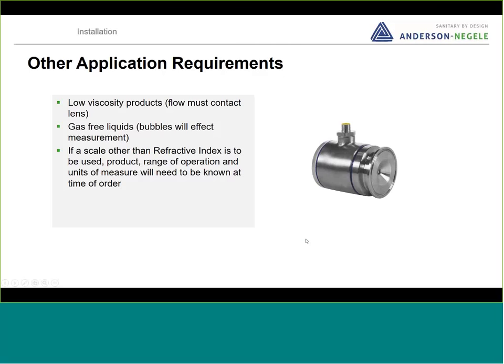Because keep in mind that this unit does not have directly a display to modify, and it only stores a handful of scales within it. All other scales have to be loaded externally.